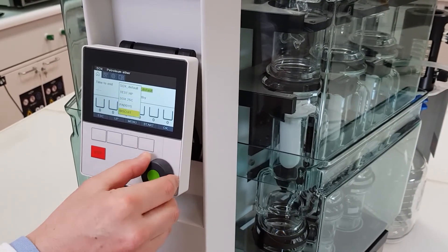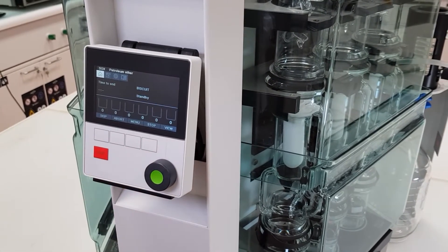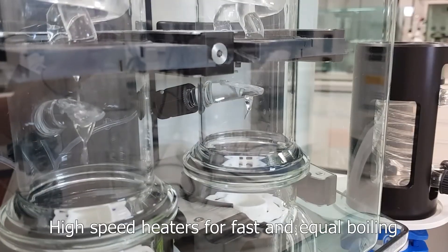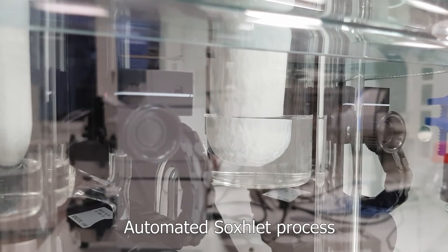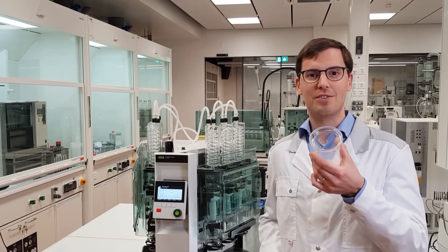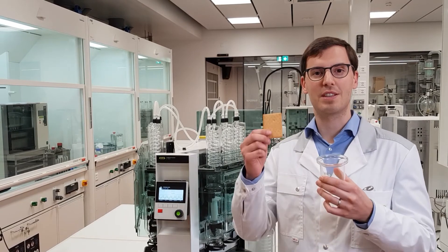We can easily select the method and start the extraction by a push of a button. After the extraction, the fat is in the beaker. It can be weighed and the fat content of these biscuits calculated.